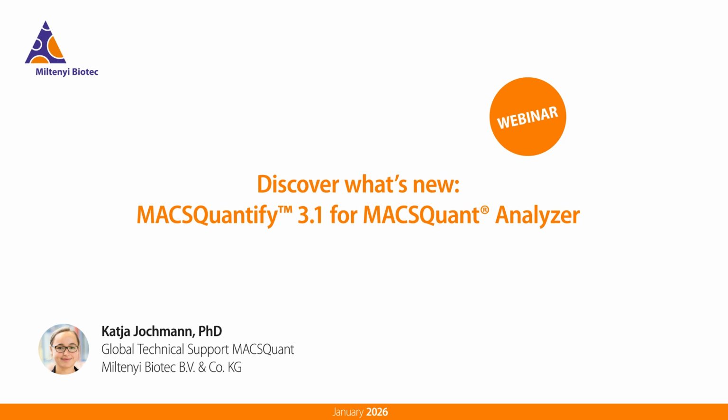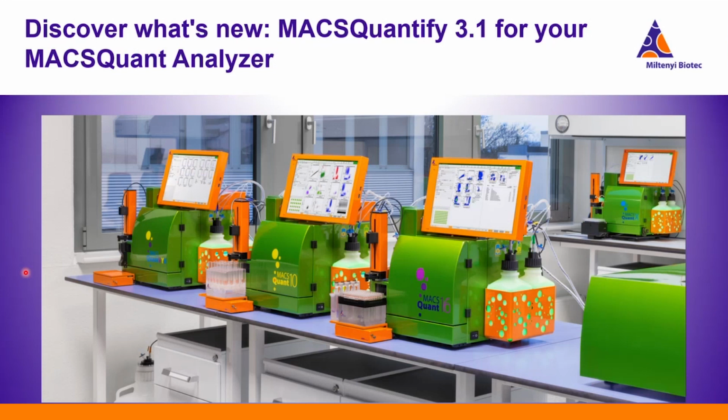Welcome to our webinar today. I want to introduce the main features of the new MACSQuantify software 3.1 to you.